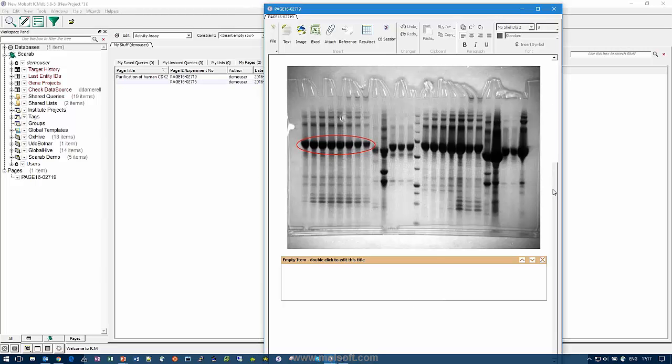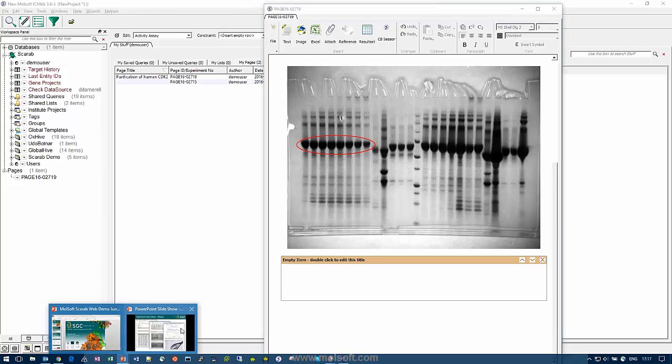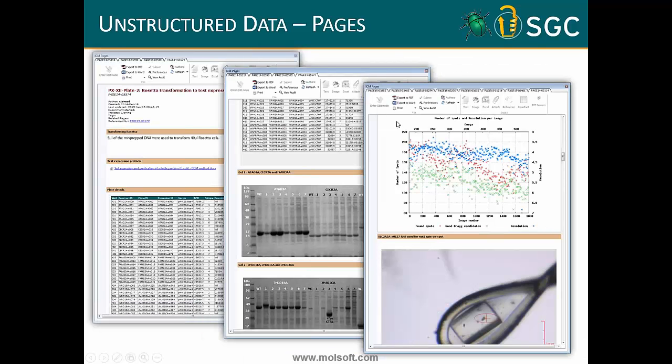The perils of doing a live presentation. Yeah, things have a little bit got stuck up. Well, what you will see, hopefully, eventually, is that the Excel section is shown in here. All the formatting is kept, but you can double-click on it, and then it'll open up in Excel. You can make changes, and then when you close Excel, it'll put it back into here. I don't know why that has all got hung up, but let me carry on with this instead.